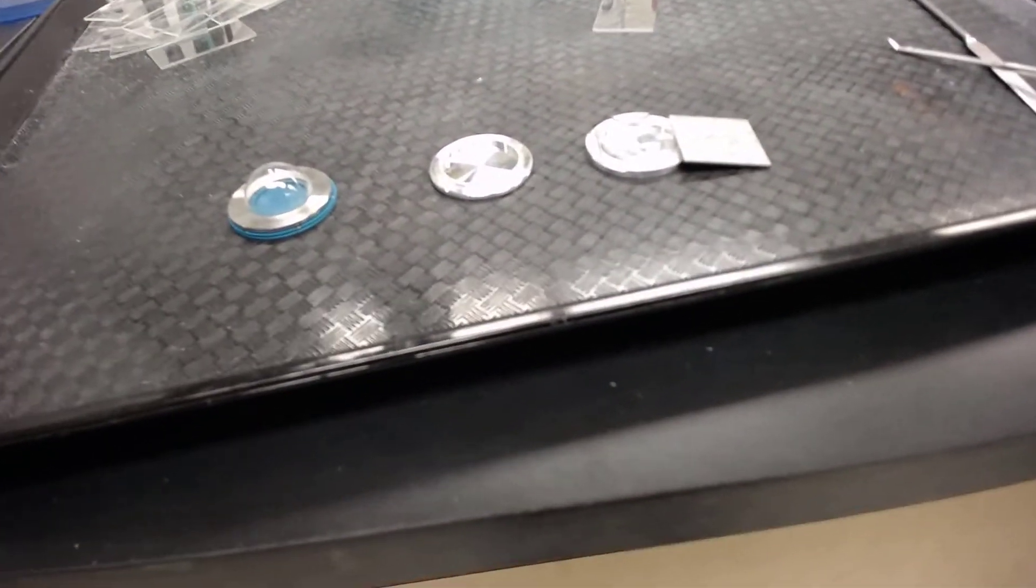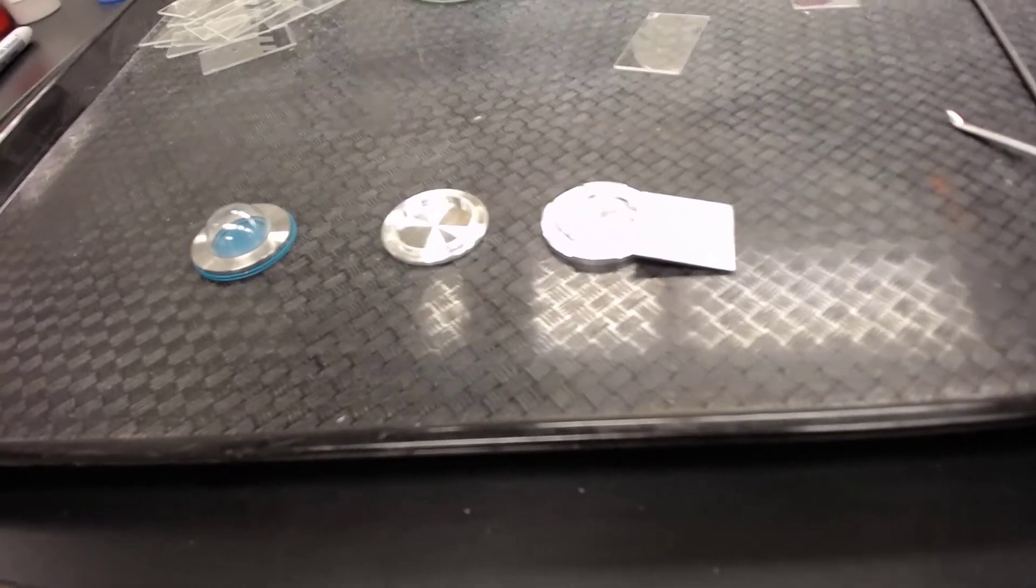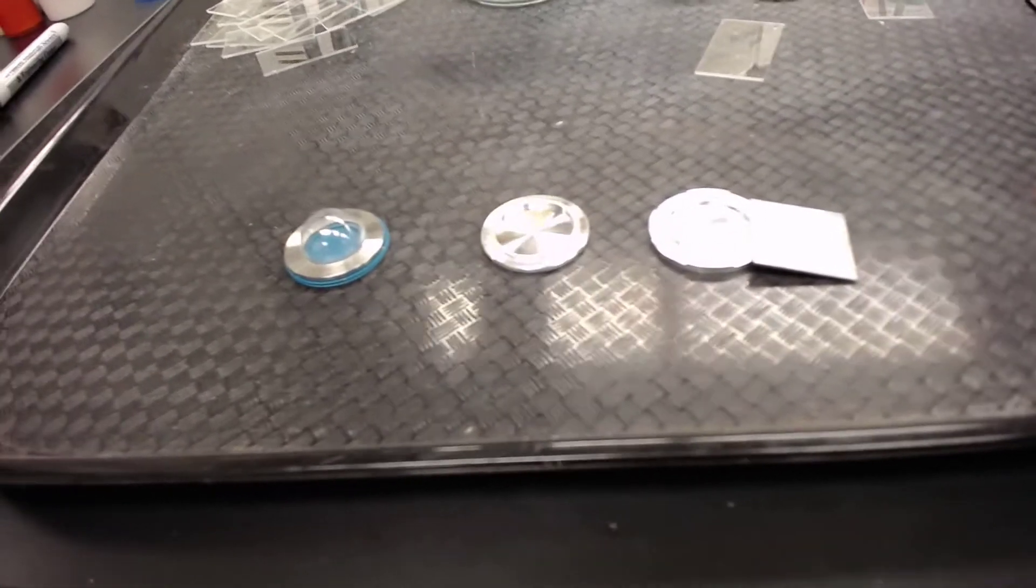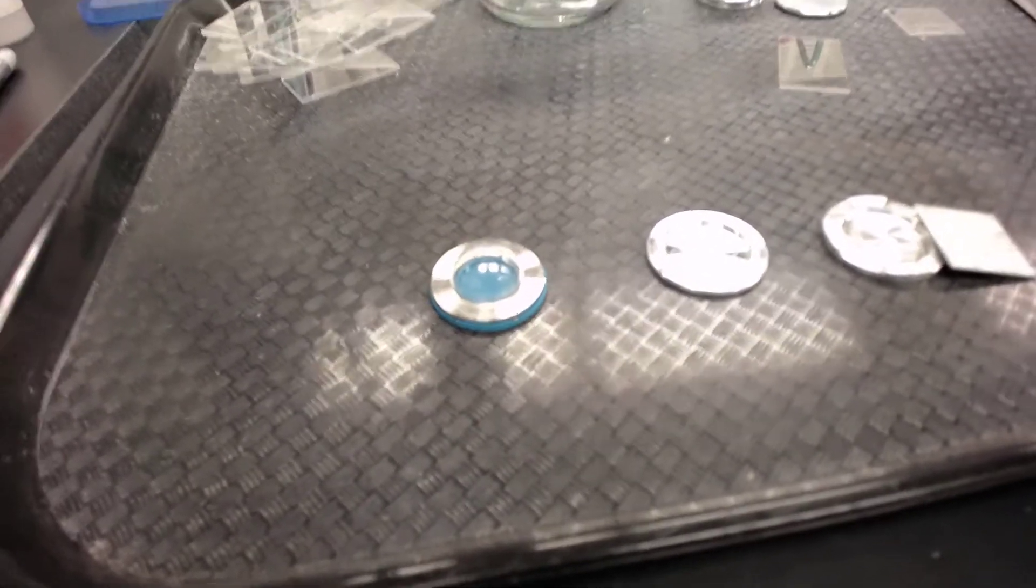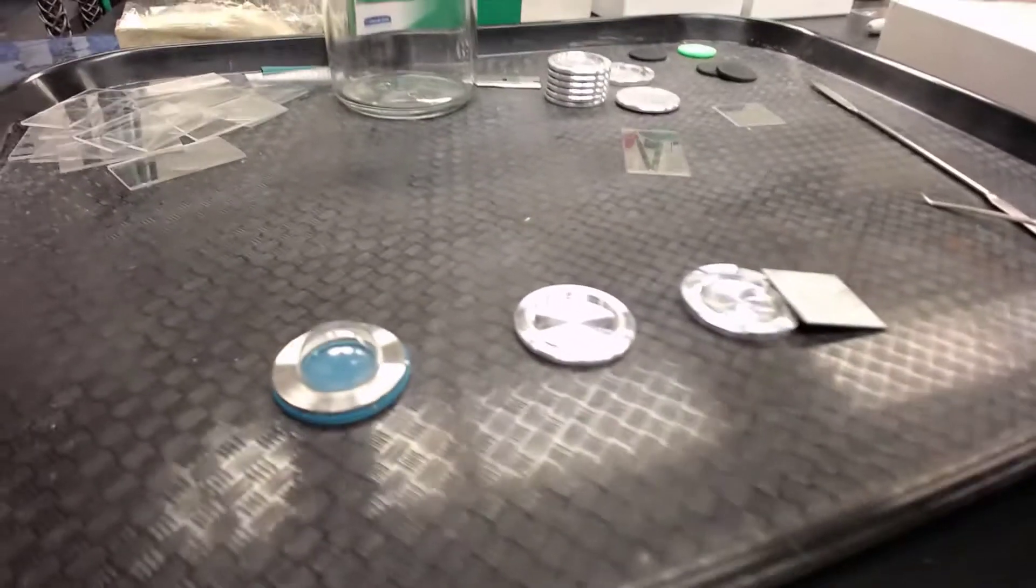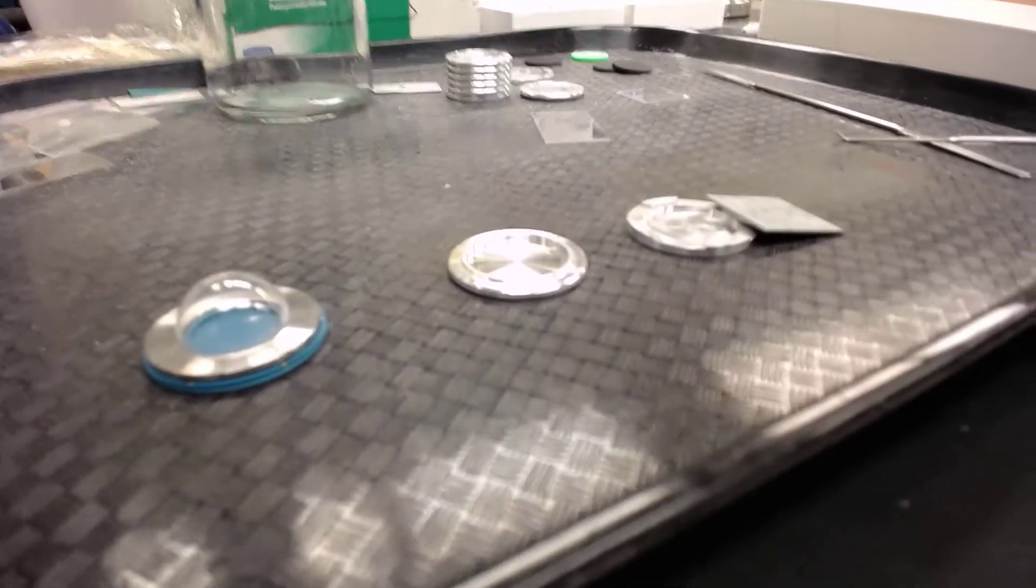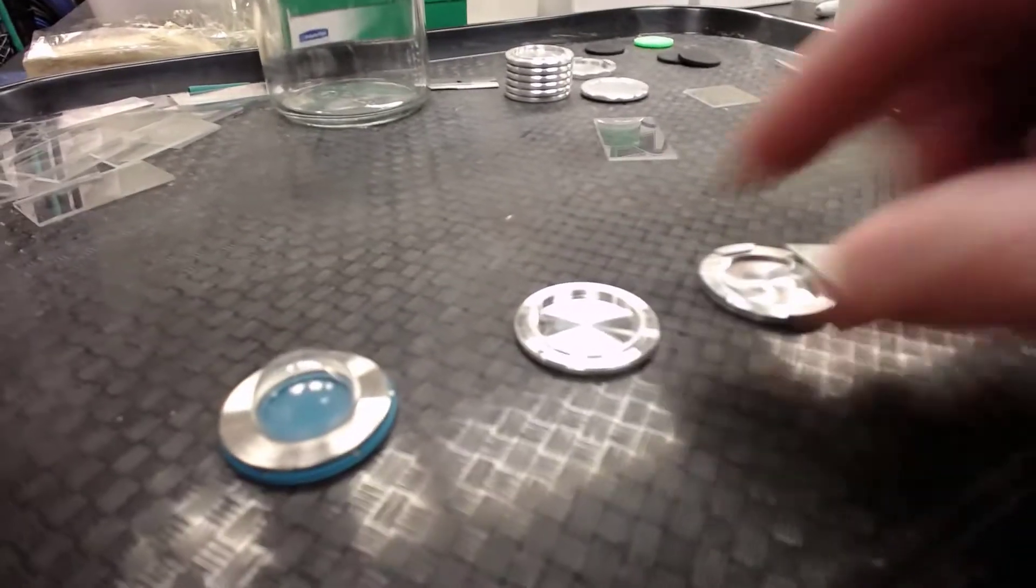Here we have a few different sample holders that we use for different types of samples. The one on the left happens to be an airtight domed holder for powders that might react with air. Sorry we have a little glare here. In the middle is a standard powder holder.